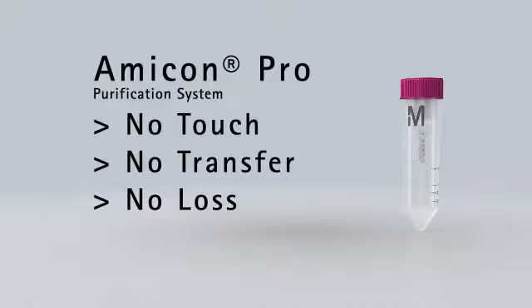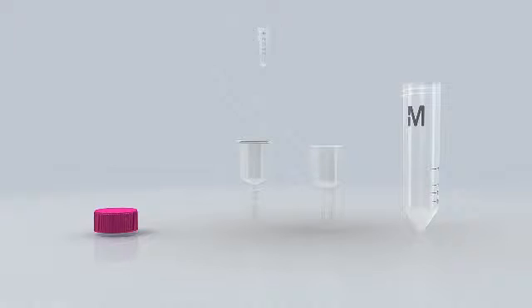Avoid the risks of sample transfer and reduce hands-on time when you bind, wash, elute and concentrate your protein in the all-in-one Amicon Pro purification system.